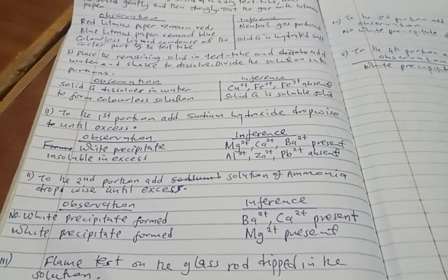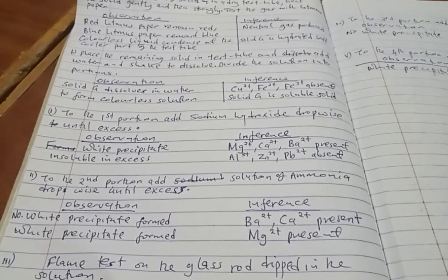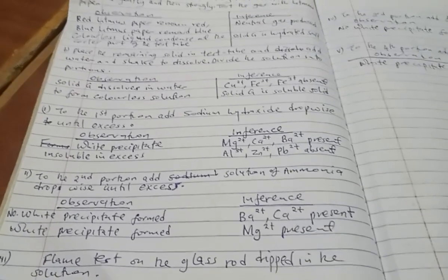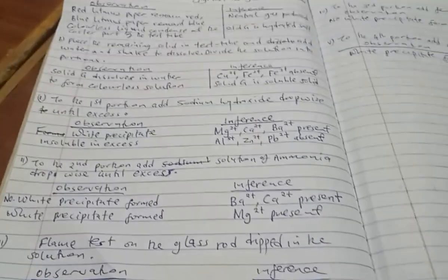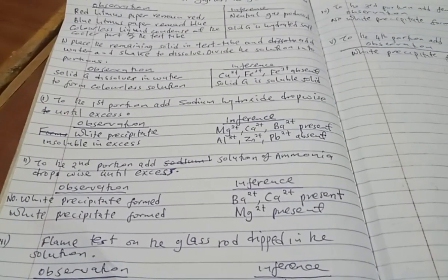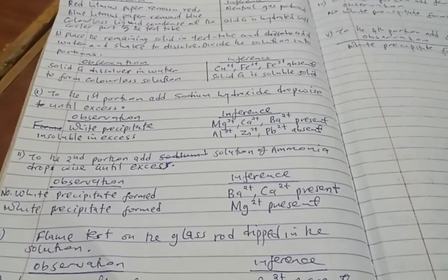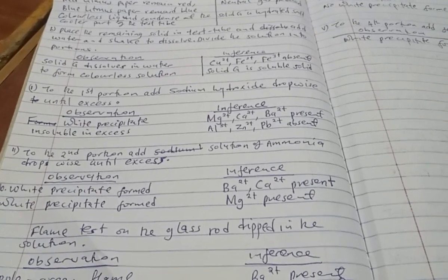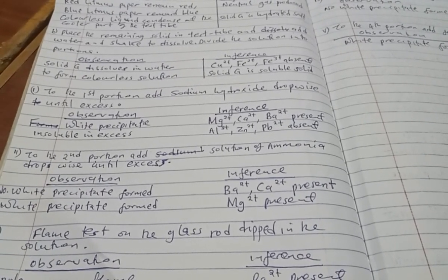Then to the next portion, you are required to add aqueous ammonia until excess. So when we are adding aqueous ammonia, if on top there you had already eliminated aluminium, zinc, and lead, then we don't expect to see them in this inference. So no white precipitate formed.